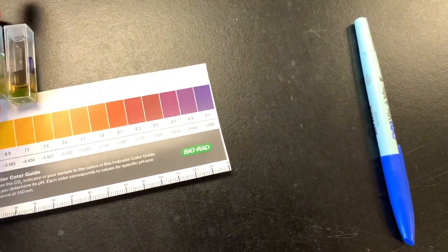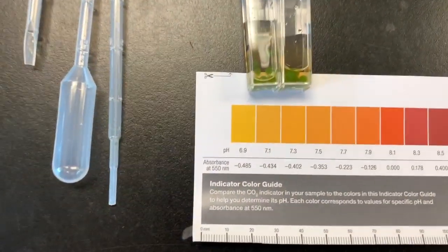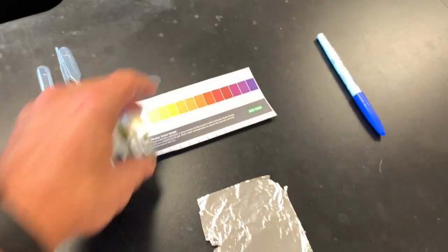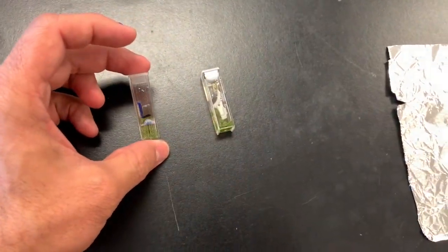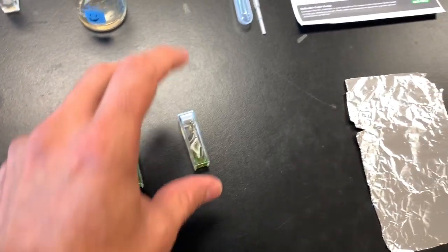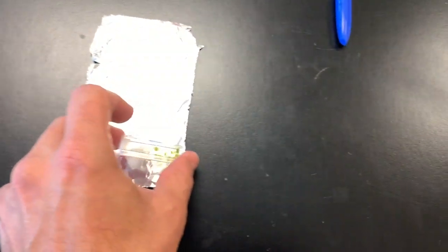It should be the same, same color there. And so then with the light one, you're not going to do anything with it, you're going to leave it as is. The dark one will get wrapped in aluminum foil.